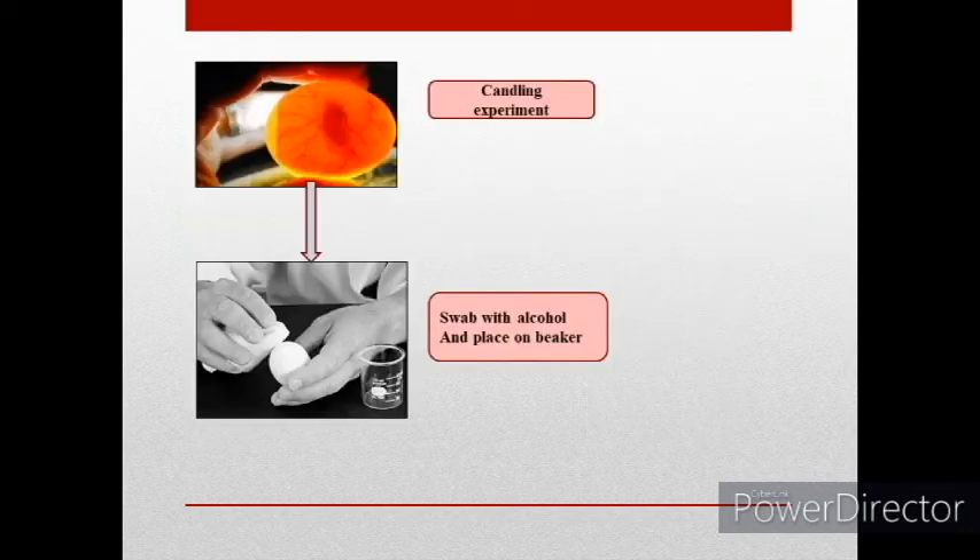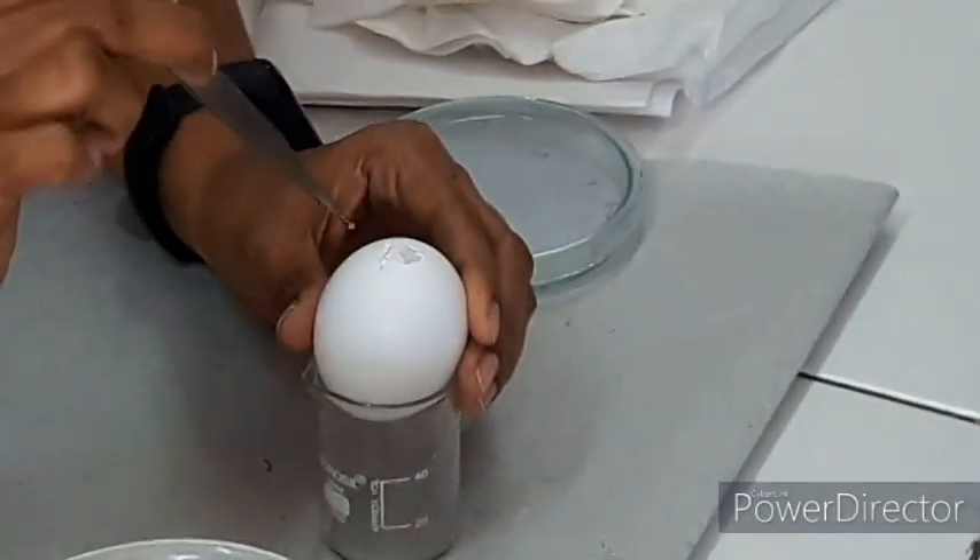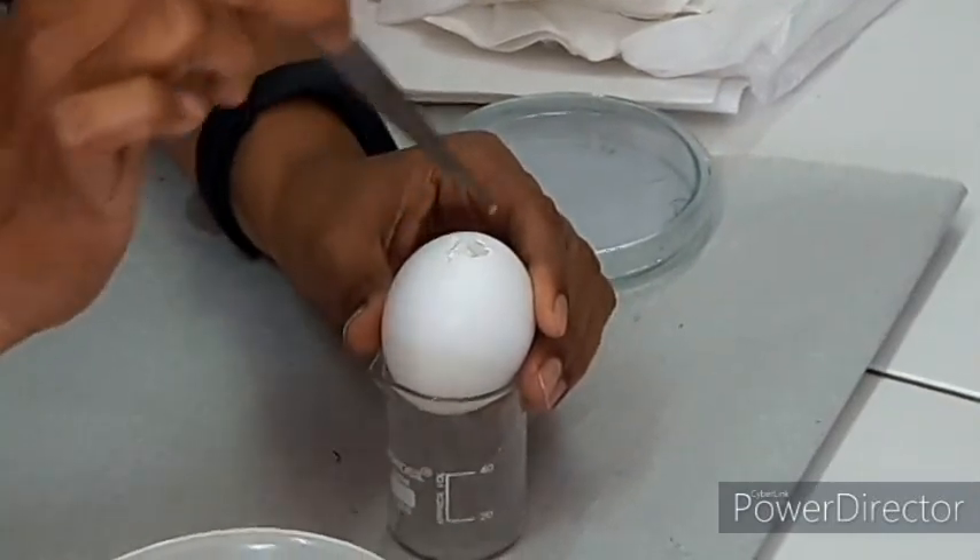The egg is candled and then swabbed with alcohol and placed on a beaker, with the blunt surface of the egg facing upward on the beaker.